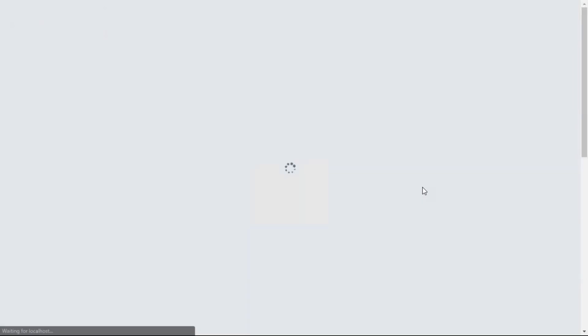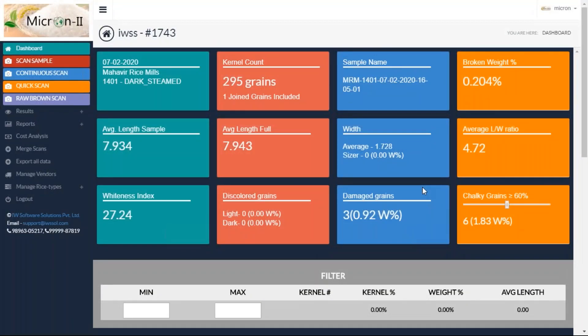Let's wait. Here it comes. When I see the result of this analysis, it says there are 295 grains in total, one joint grain. In case two grains are joined, it tries to separate them automatically — if it is able to do it, it tells you. It also says there is some amount of broken grains in this particular sample.